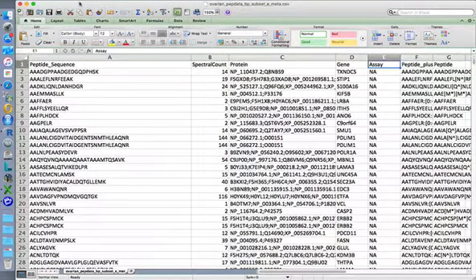The third file is optional, and this is a metadata information file. This file contains a mapping of the biomolecule listed in the expression data to other types of biomolecules. For instance, a mapping of peptides to either proteins or genes. In this file, the first row is the header and contains the names for each column.